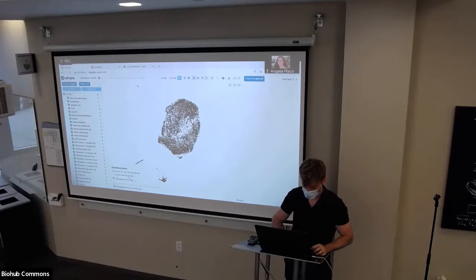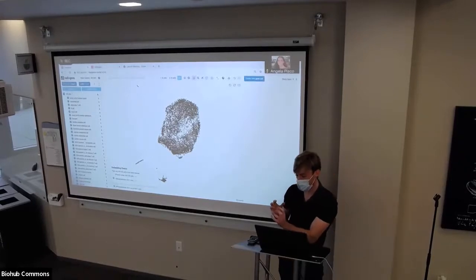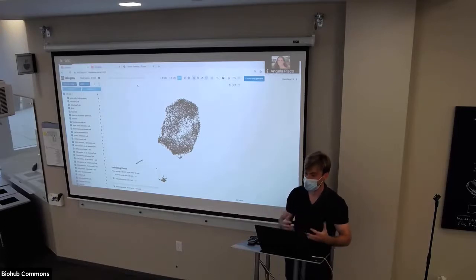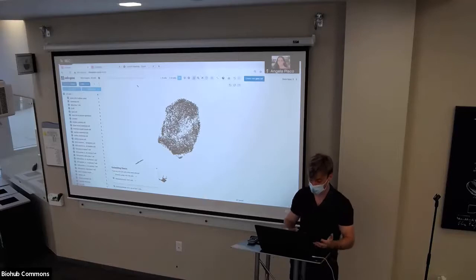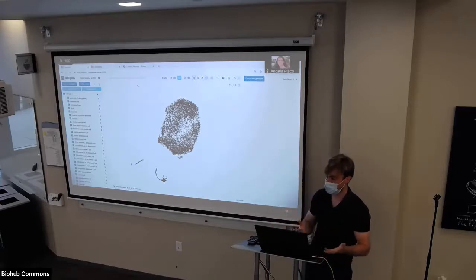That blob now has these three little things on the side. We've reanalyzed it and repositioned the cells in a low dimensional space. Because we're only analyzing kidney epithelial cells, PCA is having a much easier time finding the genes that best separate out their subtypes. When you analyze the full data set at the same time, PCA is dominated by global signatures of variation, genes that are different between tissues as opposed to sub-cell types. This isn't even a tissue, this is kidney epithelial cells. So the first thing we can do is start differential expression analysis to see, are these clusters legit? What are the genes? Can we start labeling them?